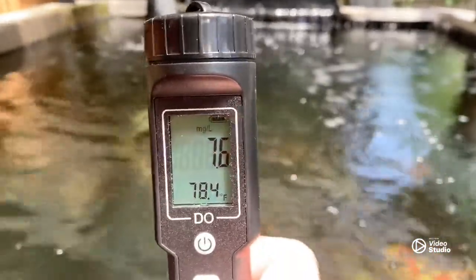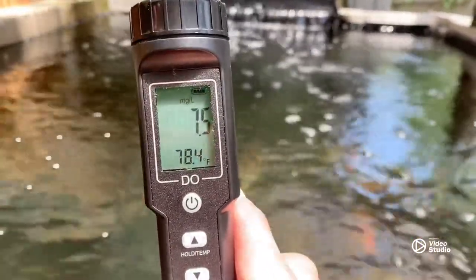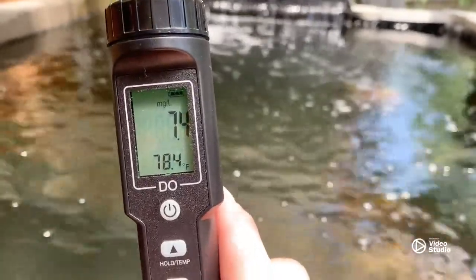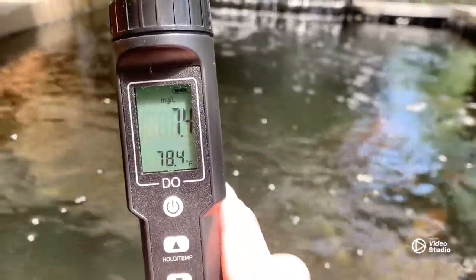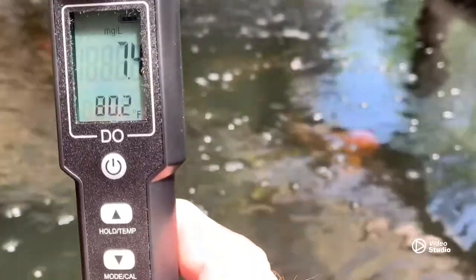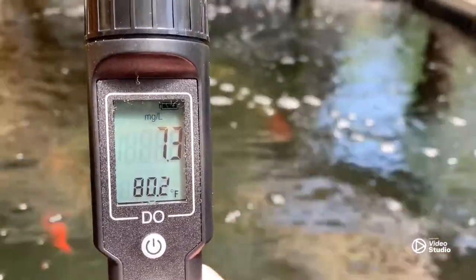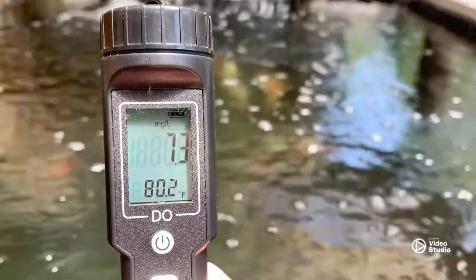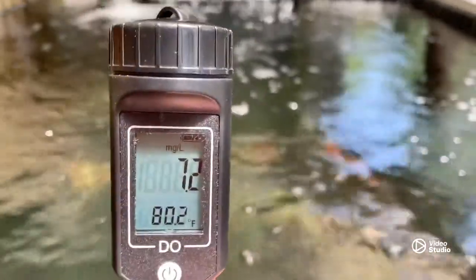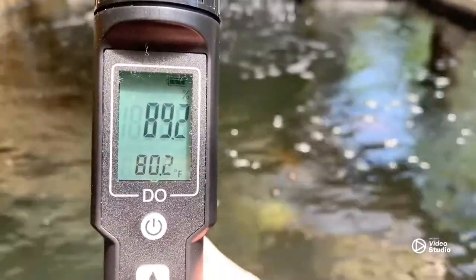If I hit mode, my parts per million of dissolved oxygen is 7.5 right now, but the temperature still has a ways to go so we'll let it stabilize. The water's around 81 degrees — it's showing 80.2 and an oxygen level of 7.3 parts per million, or milligrams per liter. Pushing mode again shows the water oxygen content sitting around 89 percent.